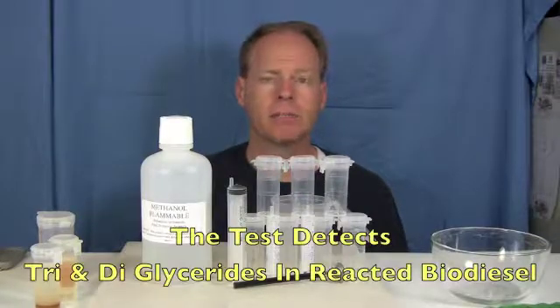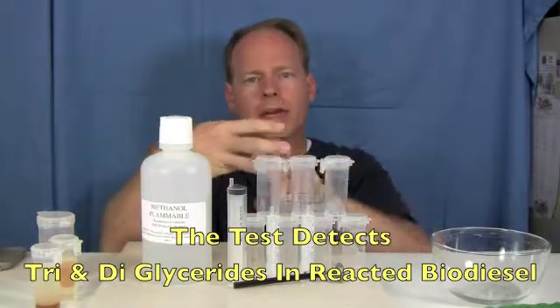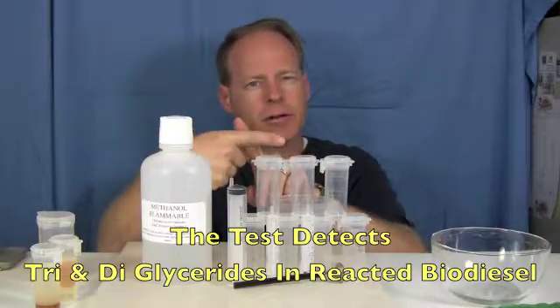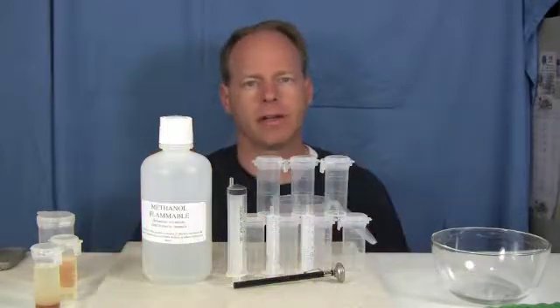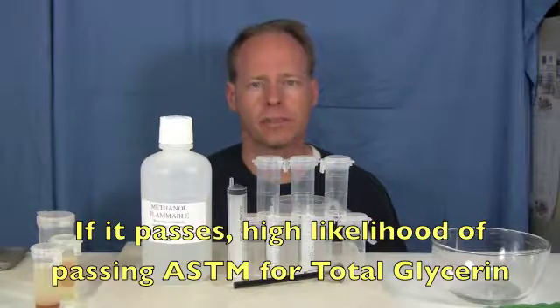We found out that the test measures what are called triglycerides and diglycerides — in other words, portions of the oil where all three fatty acid chains are still attached or two fatty acid chains are still attached. It's not terribly accurate at measuring monoglycerides, but for the tri- and di-glycerides it was very accurate. If you pass this test and do it properly, there's a good chance that you'll pass the total and free glycerin test in a lab.